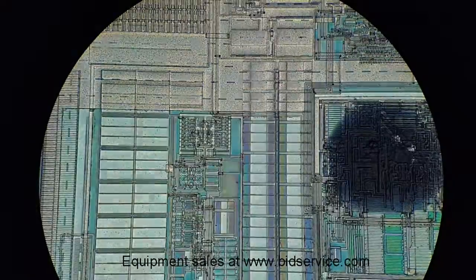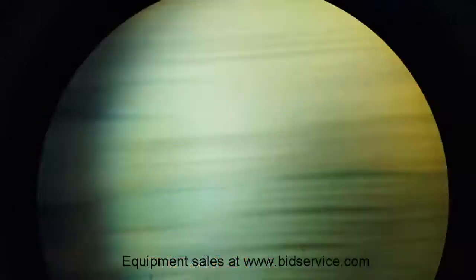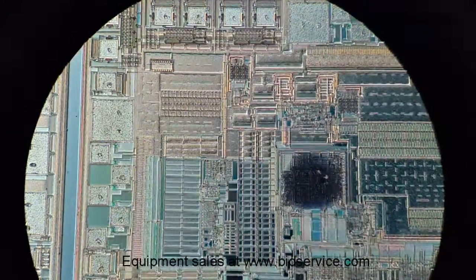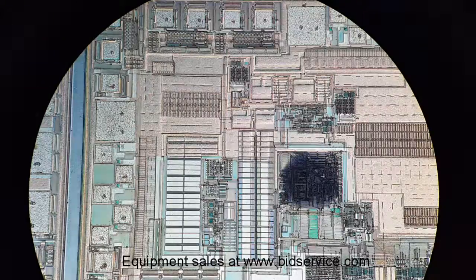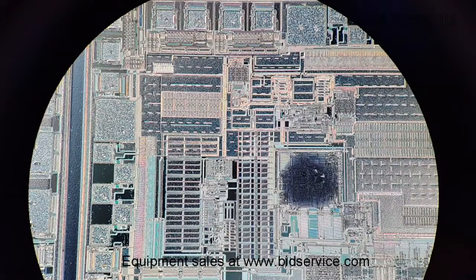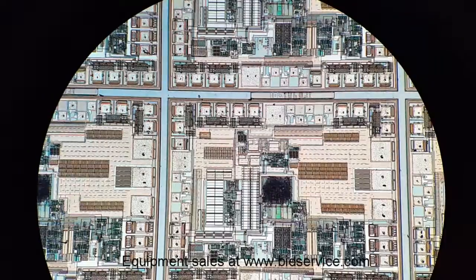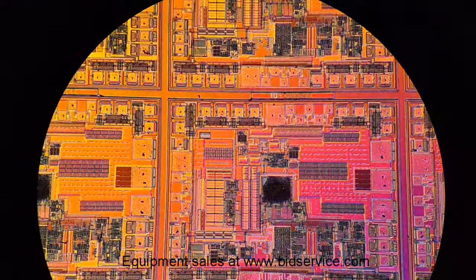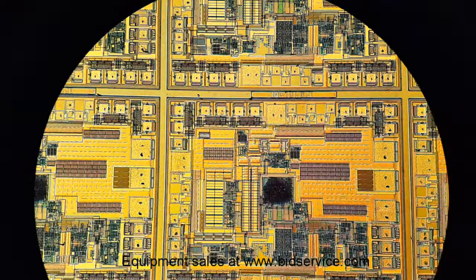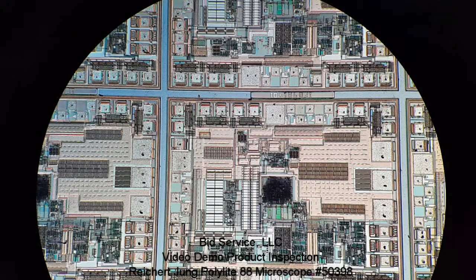Here's the 20x — move the prism in or out. Then 10x. You can see the camera doing a little searching — that's what that image change is. And finally the 5x. I chose to look through the eyepiece because the image quality is much better than this old monitor. Okay, I think that about wraps it up.